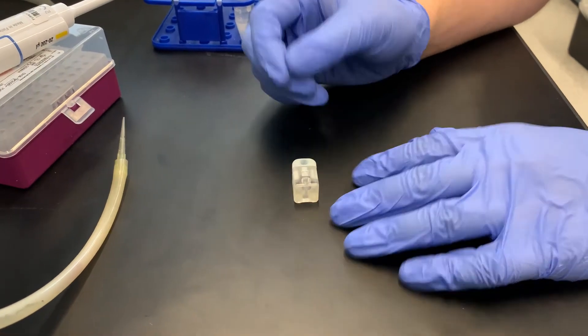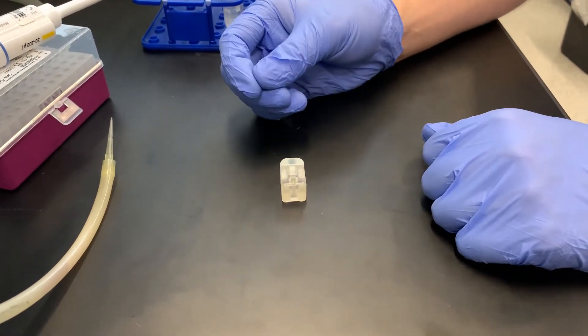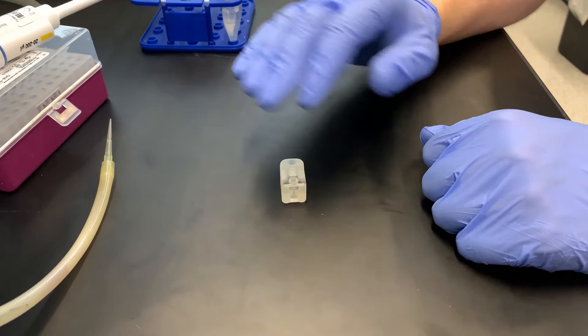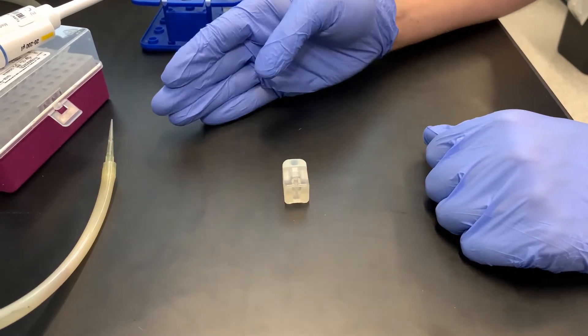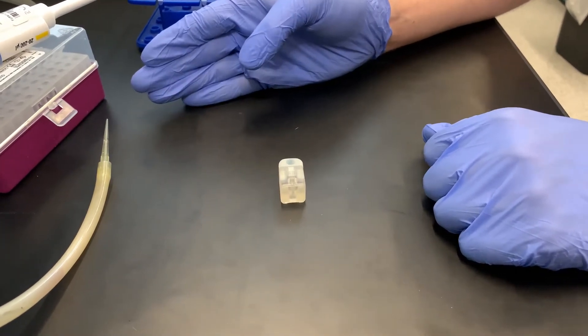Now that the cell is assembled, we want to flow in our salt solution. To ensure that the chip is entirely wet, we're going to put in IPA and then chase that with our 1 molar KCL.